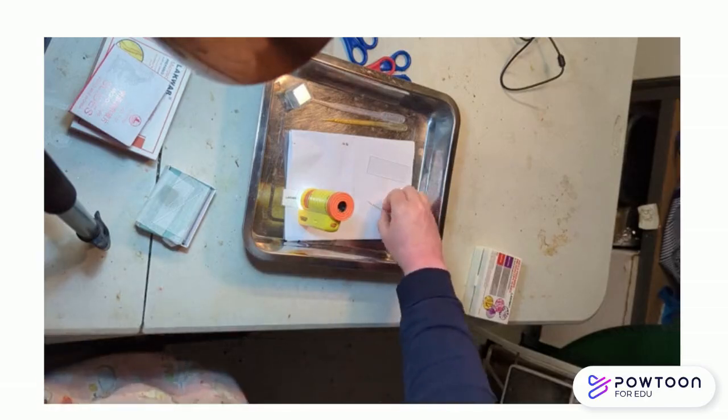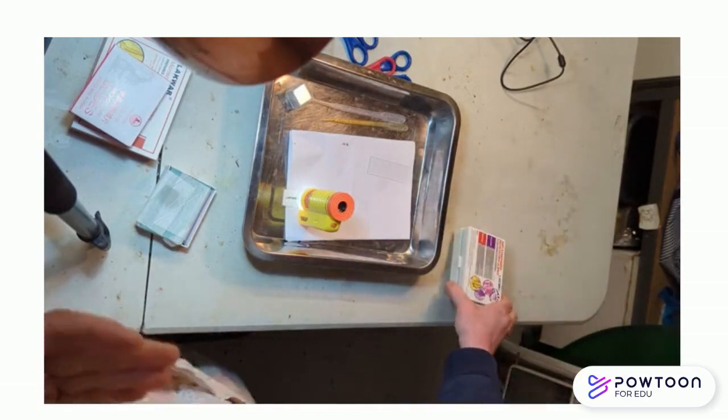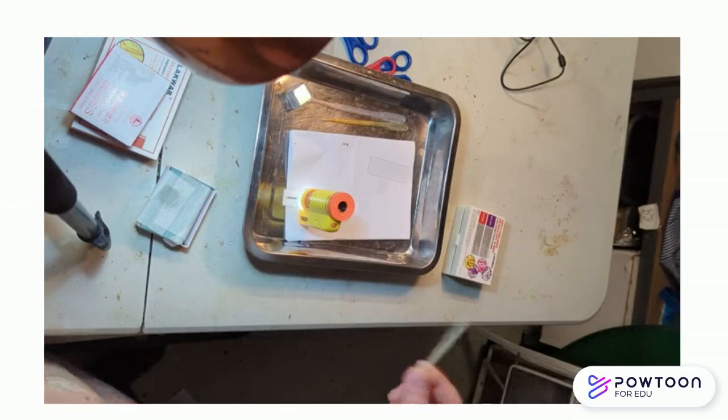But now, let's say you have already sorted out the juniors, they are doing their pre-prepared slides, they've all checked their pre-prepared slides. You, on the other hand, you and your seniors are preparing yourself the section. So if you're watching this, you already watched the video that we have uploaded about how to check the cells in an onion. And this is just in preparation of.